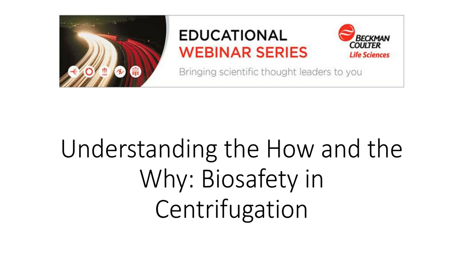Bob, if you have a better way to explain three dimensions verbally, go for it. I like the idea of the viewpoint being from the center of the rotor, but in the slide, I just looked at it. The diagram on the left is a symmetrical one, and the one on the right is the one that is an improper loading. So really what you're looking for is just symmetry.